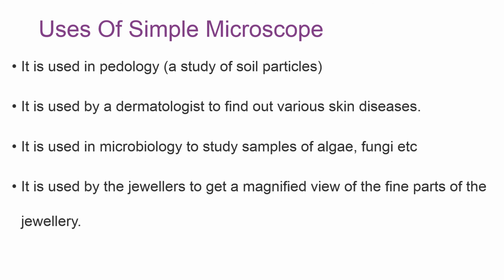Now let's recap. We've seen that the microscope is an instrument that can be used to view objects that the eye cannot see, and we also made mention of the fact that the word micro means small and scope means to observe. So there are certain tiny things that can be viewed with the microscope and which cannot be seen with the eye. We made mention of the cells, the red blood cell, the sperm cell, and the rest.